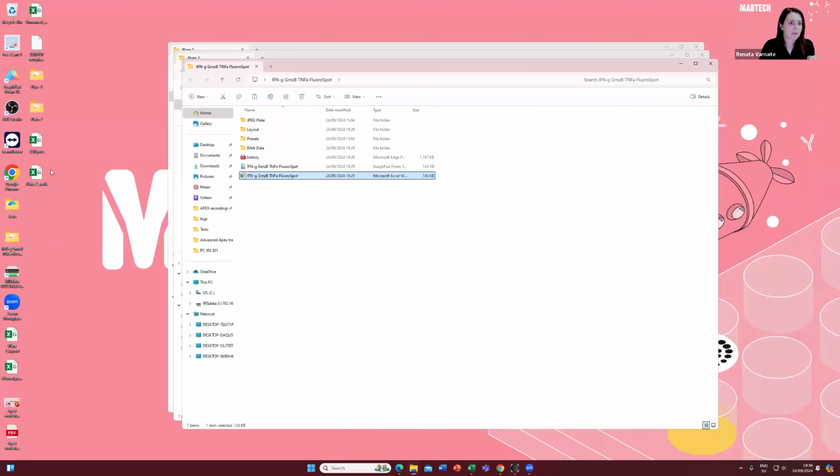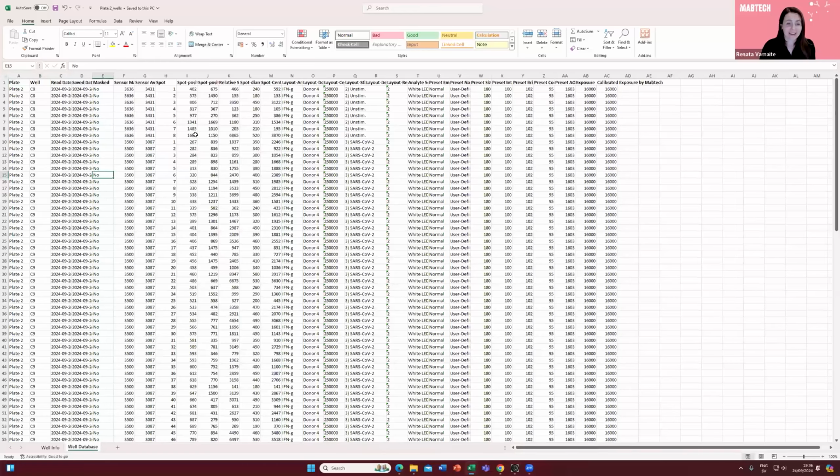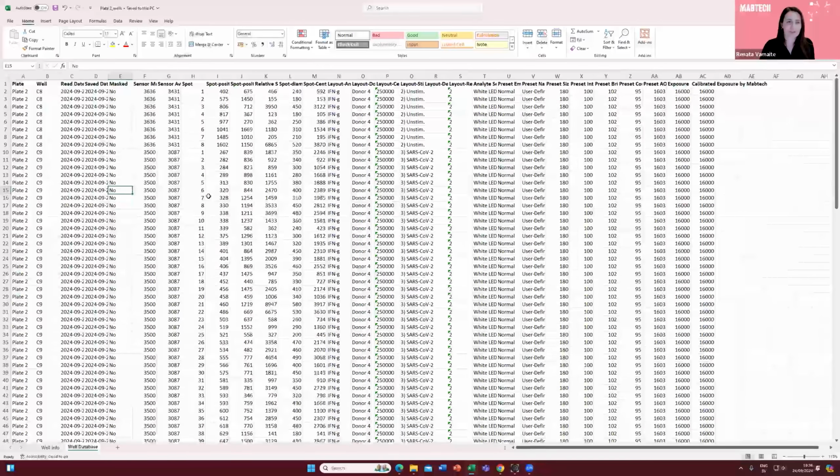And let me open that. So here we are, plate 2 wells, and that's the Excel from those 2 wells. So I'm just going to open it. And again, another table that we're looking at, which is very, very big. But as I say, it's very easy to deal with because we have this pivot function integration ready.